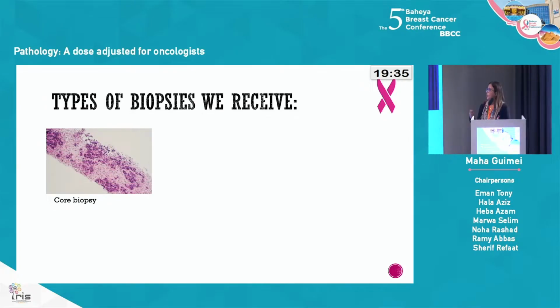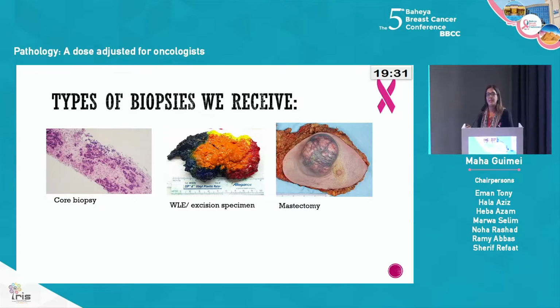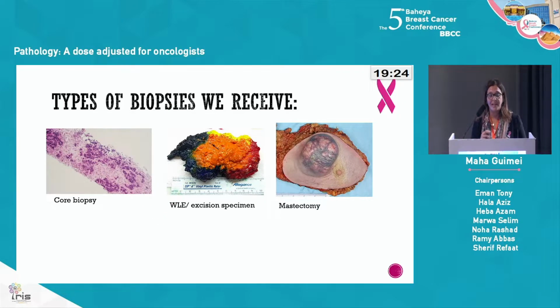طب هدخل في الموضوع بقى على طول عشان الباثولوجي طويل وكتير. احنا basically we receive in the lab 3 أنواع من العينات. يا تبقى core biopsy which is the incisional biopsy، يعني بناخد حته من التيومر، او مشتقات الكور زي الفاكيوم اسيستد او اي incisional biopsy. الحاجه الثانيه اللي هي الاكسيجن biopsy that we remove the whole tumor whether just an excision or a wide local excision بmargins حواليه، and as you can see we ink the margins well، or الاكسيجن specimen تماما واللي هي الماستكتومي بكل انواعها.